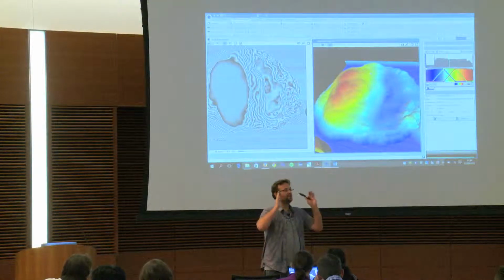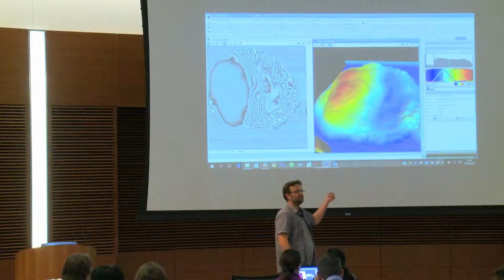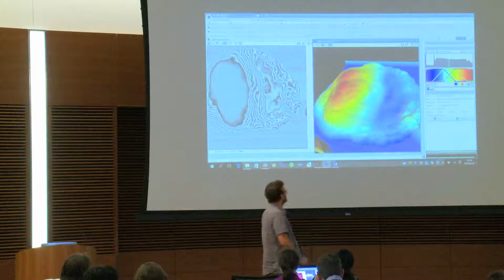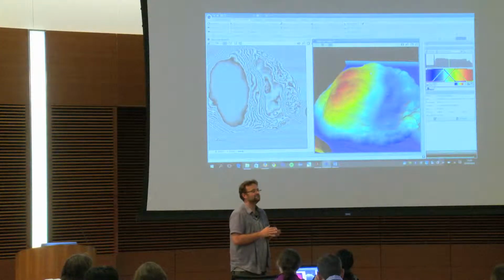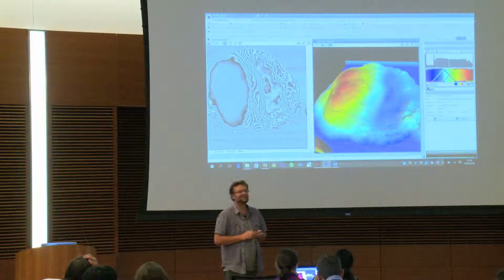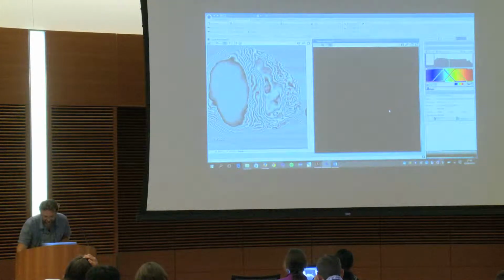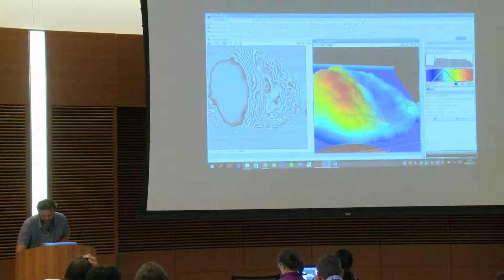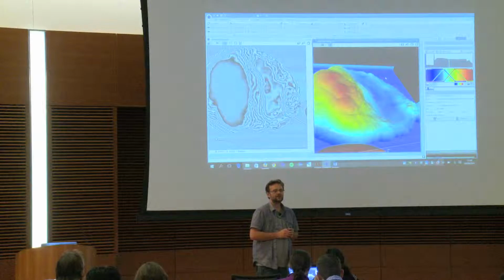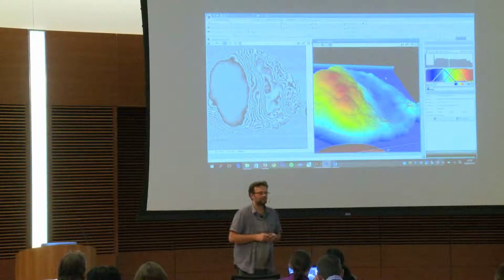And you see from the beginning, we didn't run anything, not even a blur, nothing, just observing your data. Because if you do something with this data, you're going to have something completely wrong. So there is something not natural in here. Can you see it? How many eyes do we have? Okay, I rotate it a little bit so that you can have a better look. Yeah, here now it's obvious. No? Yeah, that's it. We have a problem with the slope.